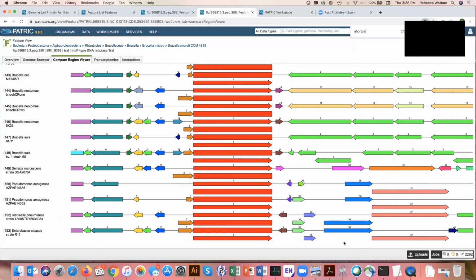In the next instructional video, we're going to talk about using the Genome Browser and capturing data, the sequence that corresponds to this area, and trying to demonstrate how you can verify that something is really missing in a different genome.